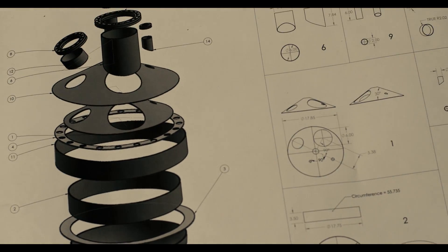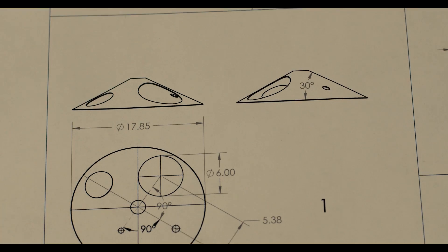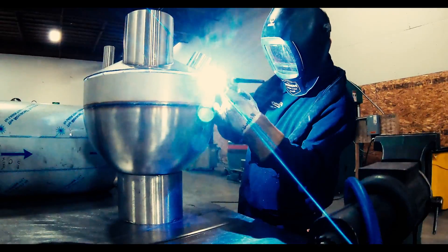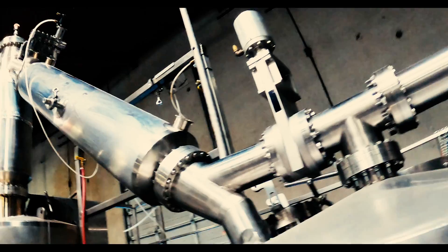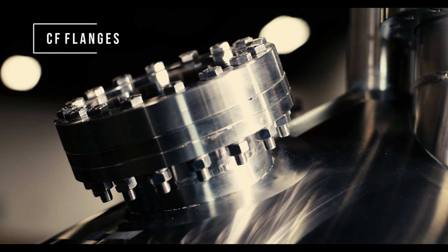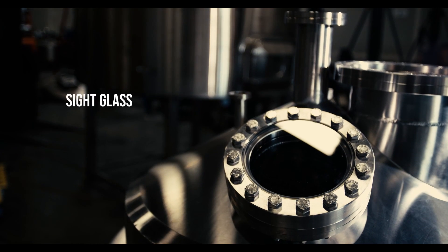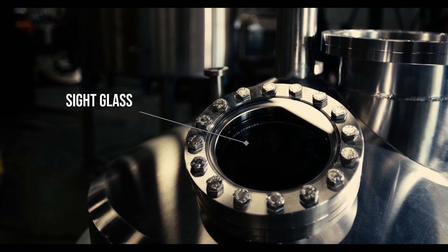Replacing this glassware starts with a concept. There was not a product for this specific process, so we made one ourselves. We borrowed ideas from our larger equipment, using ultra-high vacuum CF flanges. It's heavily insulated, and there's still a sight glass into it so you can see your reaction happening.